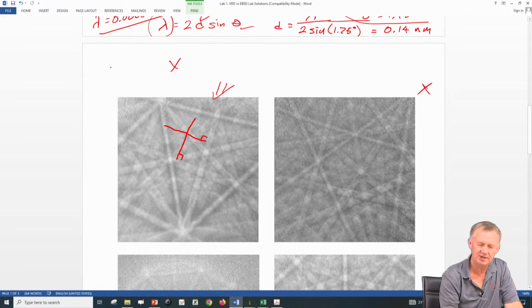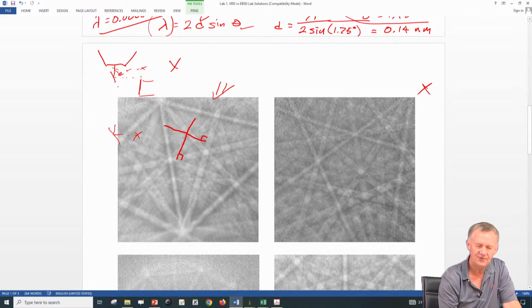The simple example that I used when we were talking about this earlier is, if you have an electron beam and you have your phosphor screen over here and you have a working distance like this, then the normal to your phosphor screen is there. If you decrease your working distance, the normal to your phosphor screen is there. If you take your working distance way down here, the normal to your phosphor screen is here, right? But this is where the image is going to be, up here. If you move the specimen around, you could move it all the way through the field of view. But the main diffraction that you get after it hits there is going to be mostly down in this range, right? So your strongest diffraction is coming like this. So that's where you want to put the phosphor screen.